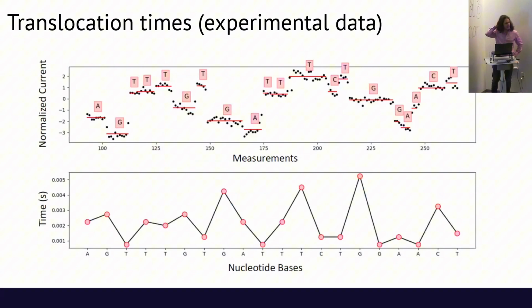This is what it actually looks like. I think this is one of the more well-behaved windows. On the top here, the x-axis is your measurements, again at a regular interval. The y-axis is normalized current, and we translate this base calling based on the current into times.